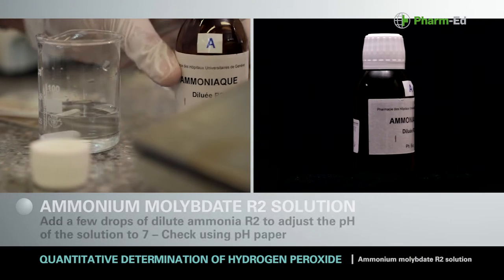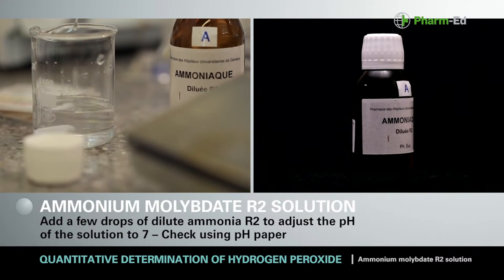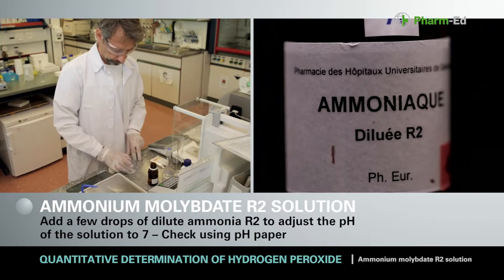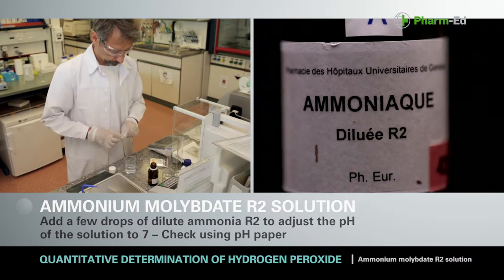Add a few drops of dilute ammonia R2 to adjust the pH of the solution to 7. Check it using pH paper.